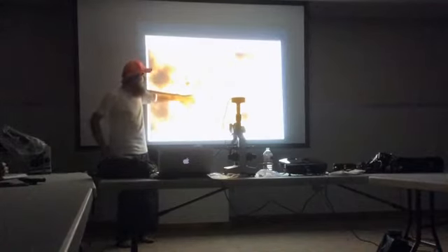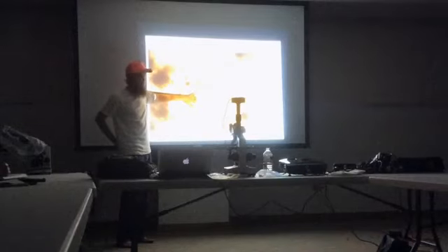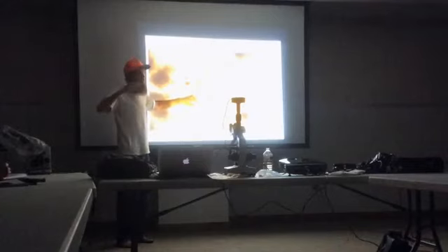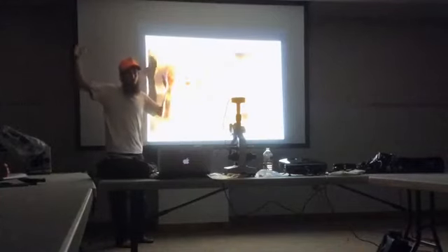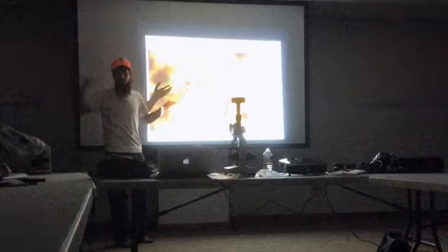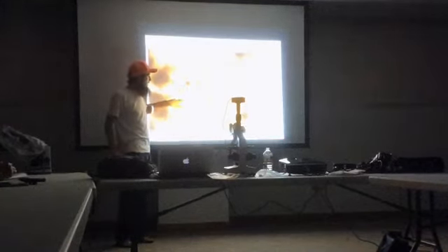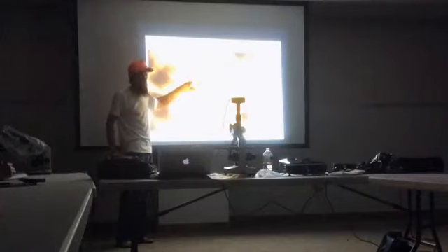So on here you might see all these tiny little things and think there's a lot of life and I have a lot of active bacteria. But really what you're seeing is just the water and the slide, and because the fan's on the table, it's making it vibrate. It's Brownian motion is what they call it. These are not active and moving, even though they look like they're jiggling around.